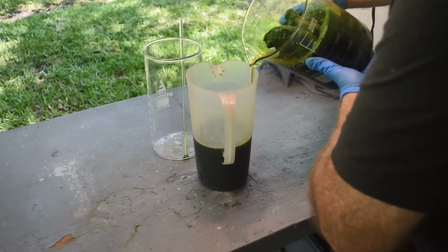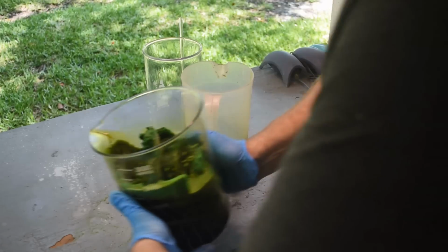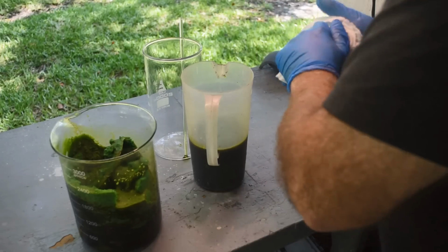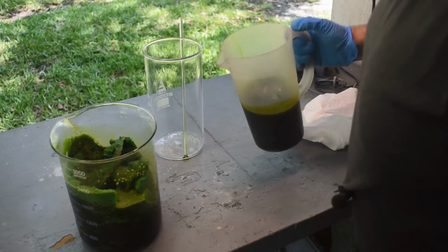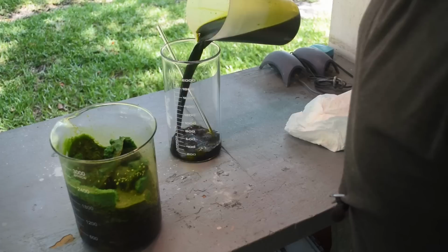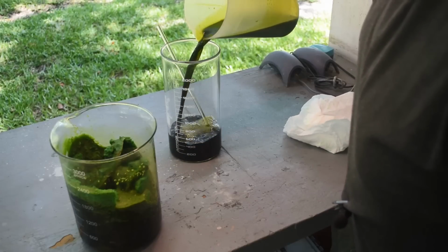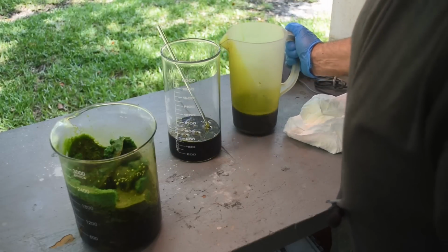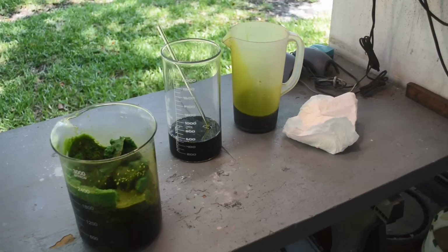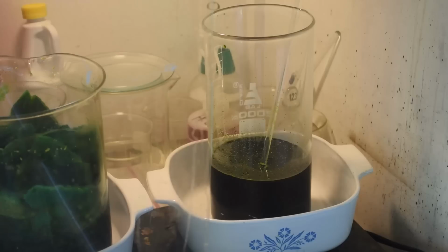Okay, that's a good start. Yeah, the bottom of that beaker's slippery. Okay, so let me put maybe half this liquid in here. That looks pretty good. We'll get this in the fume hood, and we'll try denoxing it and see what happens.